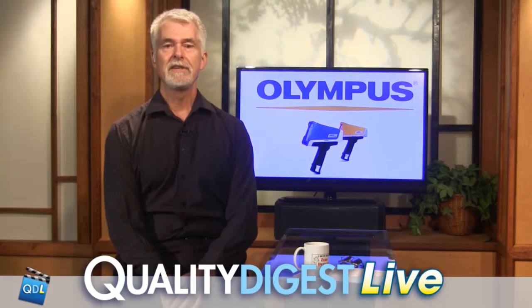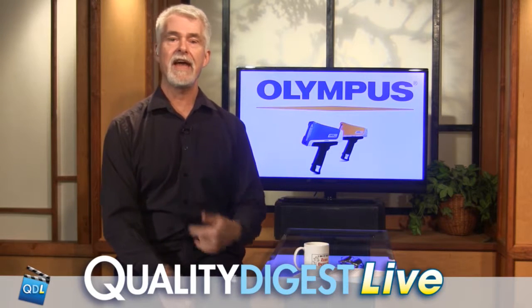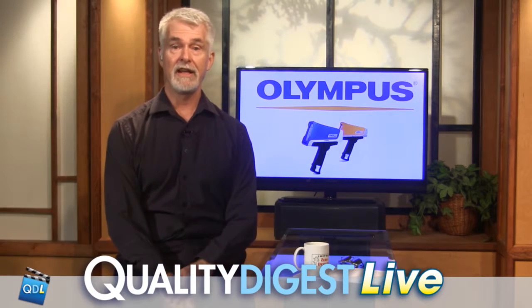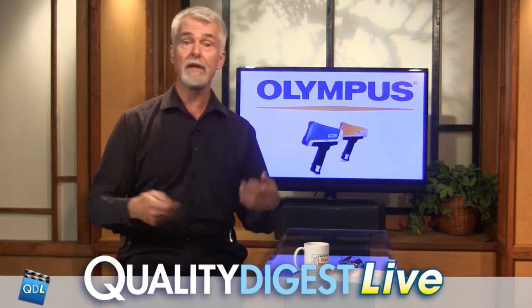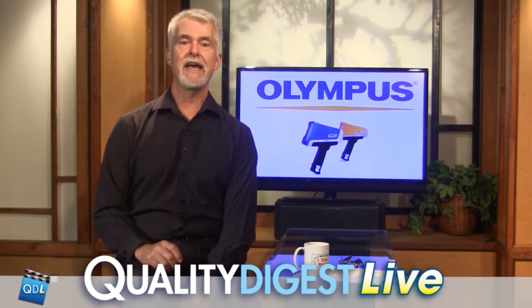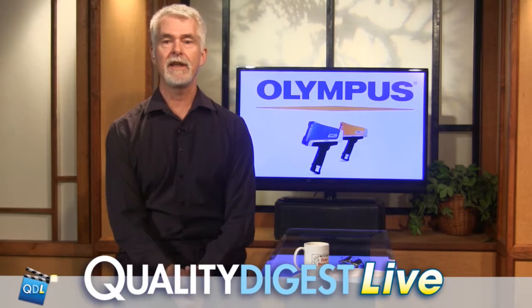Our last segment this week is a tech corner that was recorded when we had an in-house webinar with Olympus on their Vanta handheld XRF XRD analyzer. While they were here doing the webinar, we said, you're here, you got your equipment, let's do a tech corner. This is our tech corner with Diane Hillhouse of Olympus showing us the Vanta handheld XRF XRD analyzer.